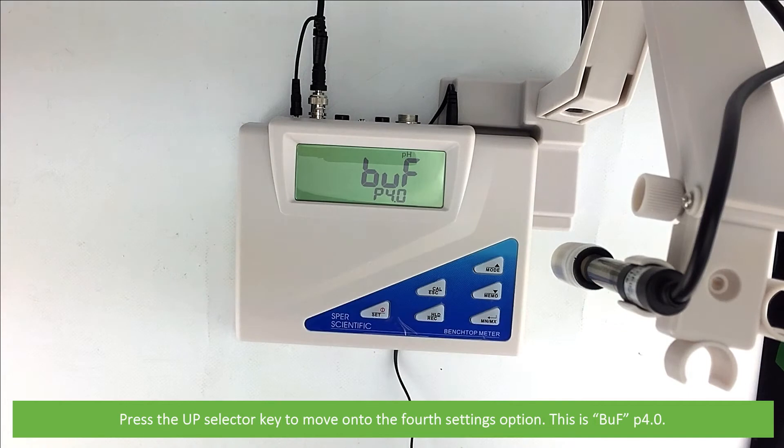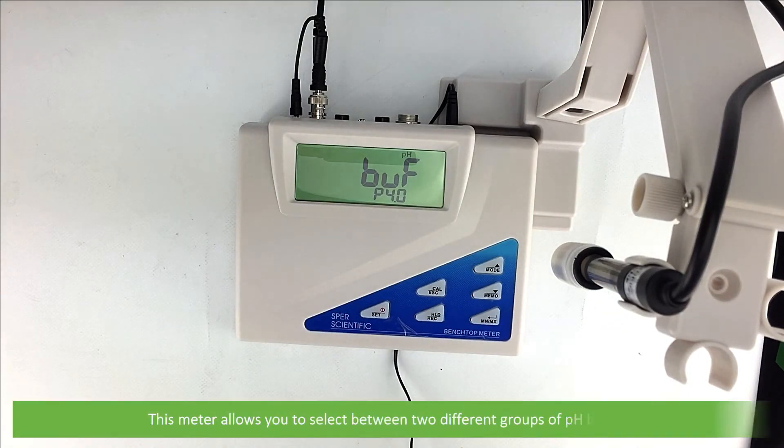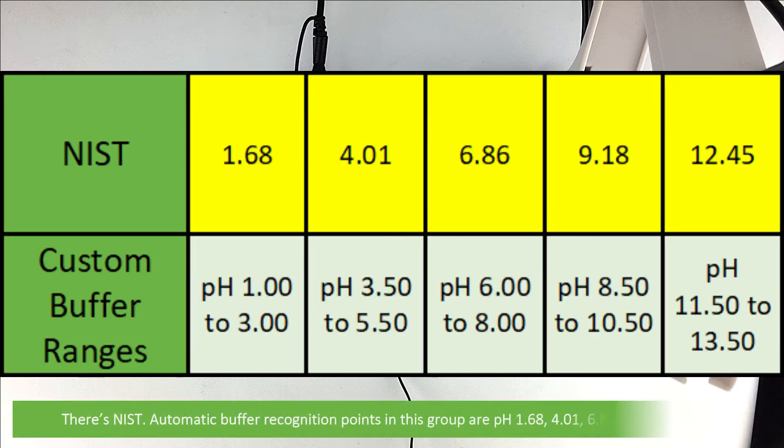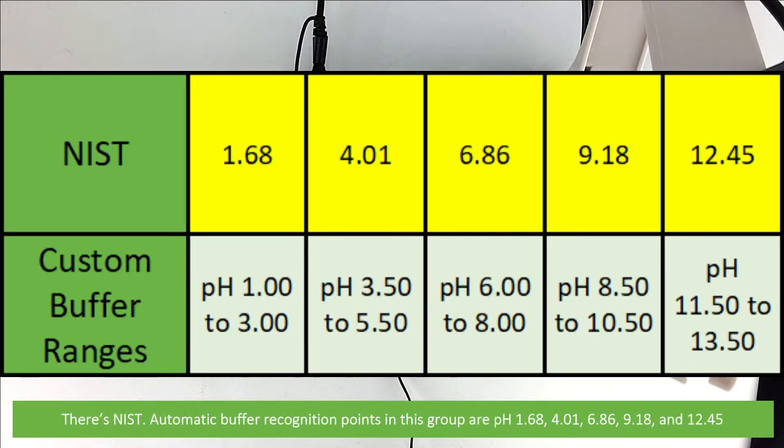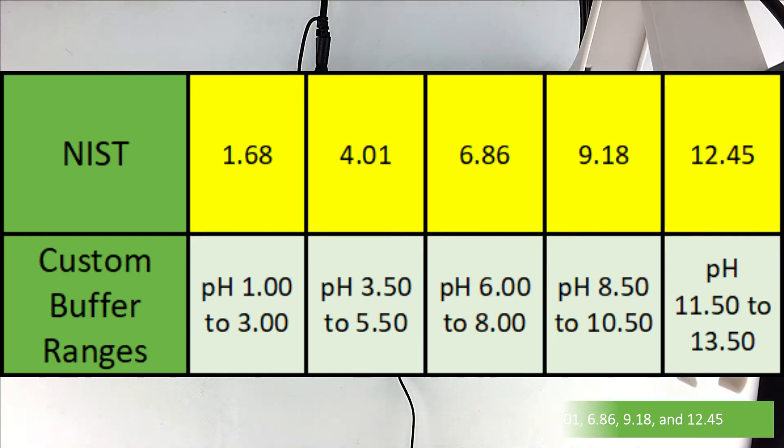This is BUF P 4.0. The meter allows you to select between two different groups of pH buffers. There's NIST. This is automatic buffer recognition points: 1.68, 4.01, 6.86, 9.18 and 12.45.